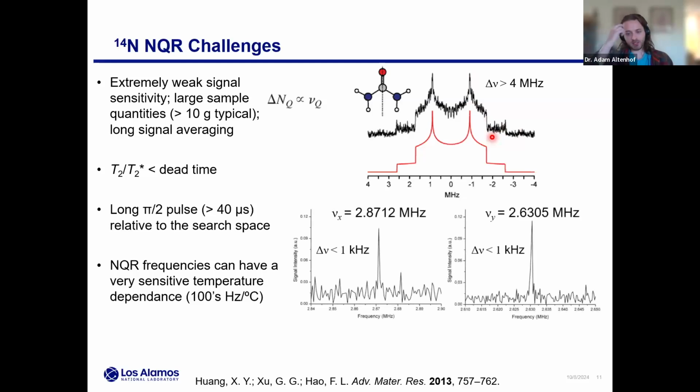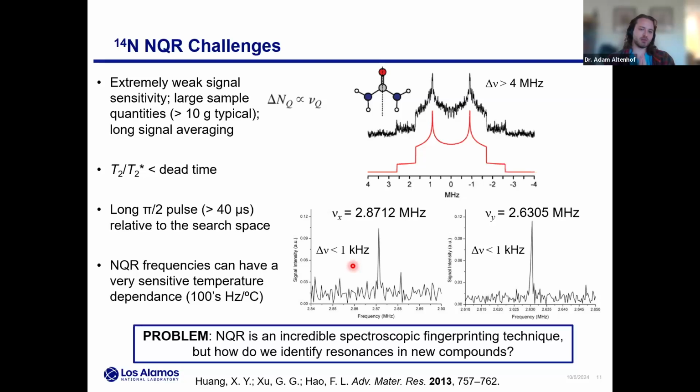Now compare this to the NQR lines for urea, the same compound. Again, we have this really high resolution, so these really precise frequency locations, but the SNR is quite low. So this is like a really extreme needle in a haystack problem. If I'm some tens of kilohertz away from the suspected resonance, I'm just not going to see it. And really, this is the main point: without any a priori information, how am I going to go about finding these resonances, particularly in new compounds such as fentanyl?